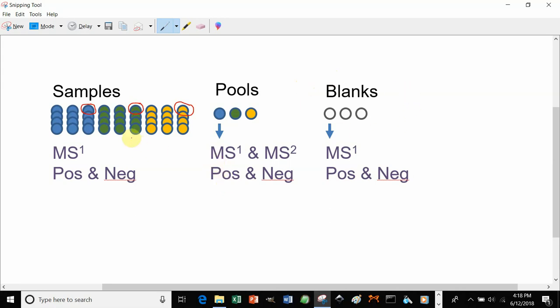In addition to running all these data acquisition steps, it is important to save your filenames the same in positive and negative polarity for your samples, as well as your blanks. So for your samples, you want each to have the exact same file name in positive and negative polarity. You can save them to different folders, and that will help LipidMatchFlow software combine your positive and negative polarity data into a single feature table.